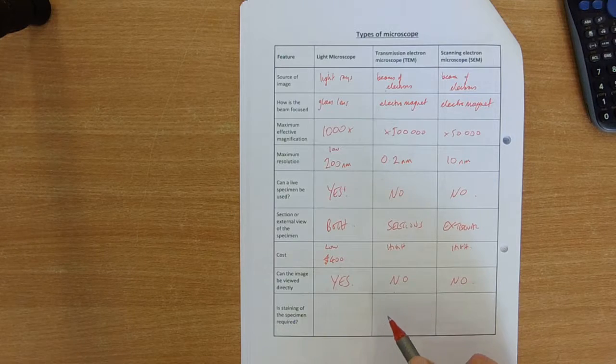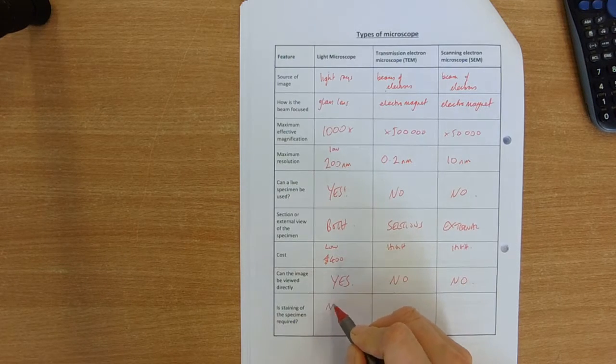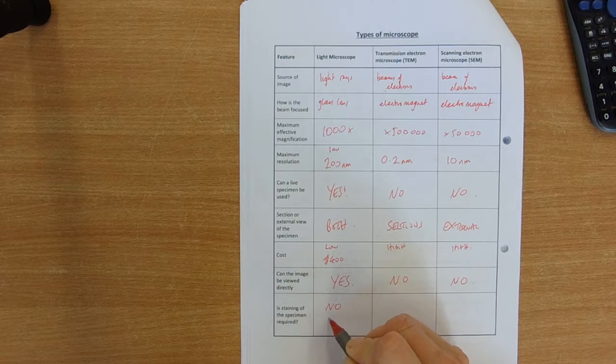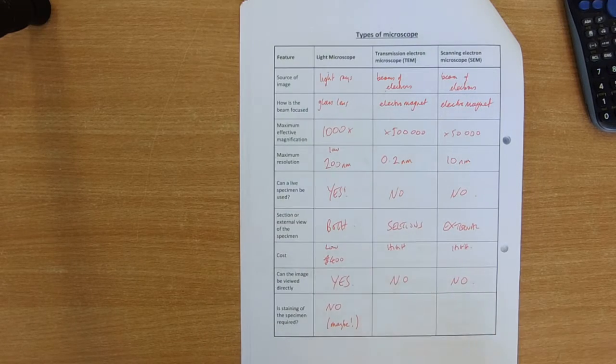And do we need to stain? No. But maybe. So if you're looking at a plant cell, you can see the cell, but you might stain it for, say, the chromosomes, or use some methylene blue or iodine stain, something like that.